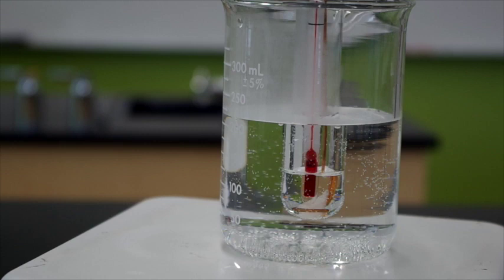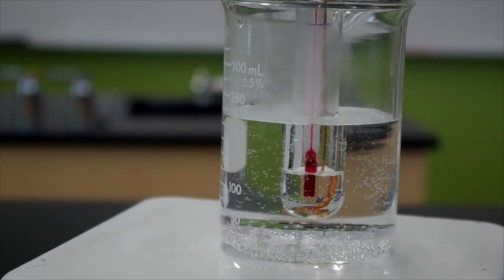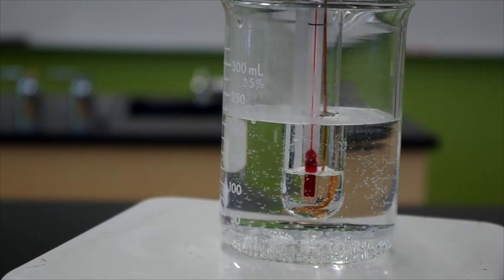This is 220. Do you want me to stop since it's melted? No. Go up to the temperature. Okay, yeah, I guess you can go up to the temperature now.